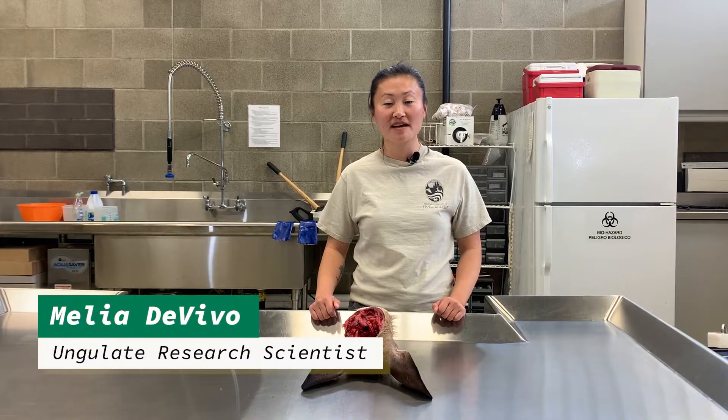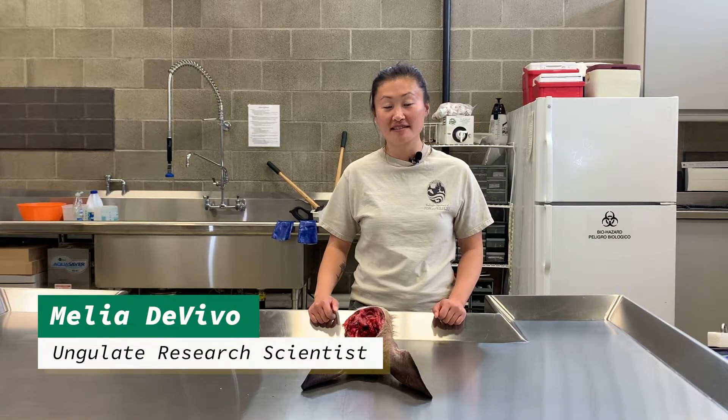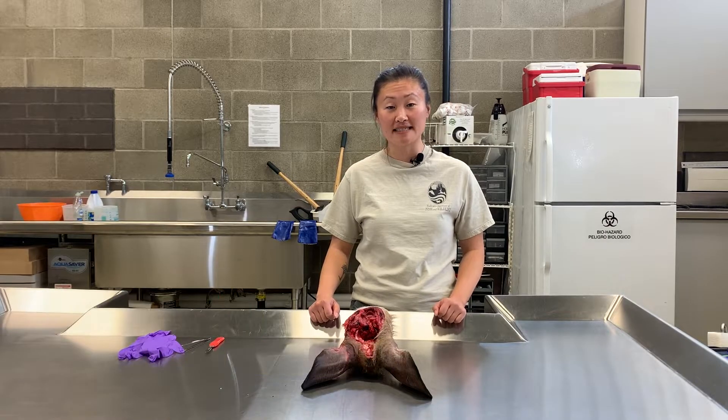Hi, I'm Malia DeVivo. I'm the ungulate research scientist for the Washington Department of Fish and Wildlife, and today I'm here to demonstrate how to take the lymph nodes for chronic wasting disease testing.